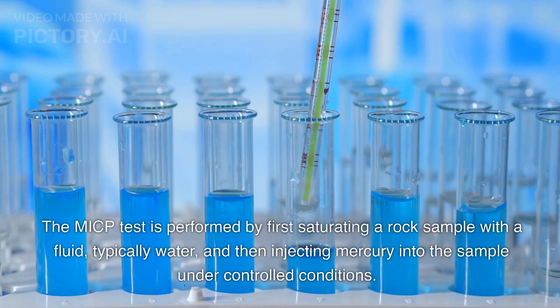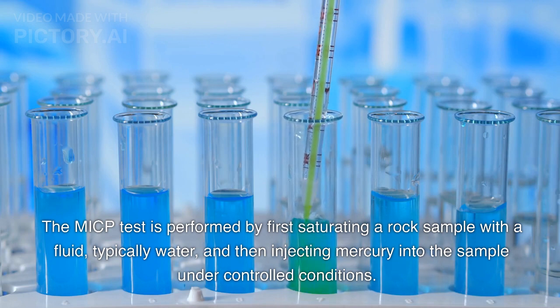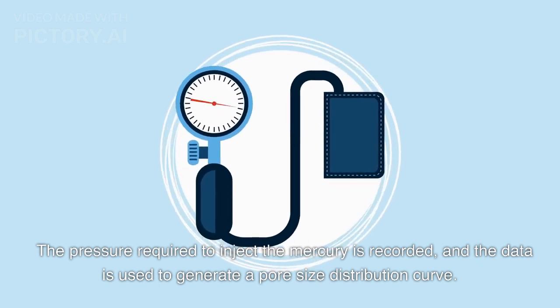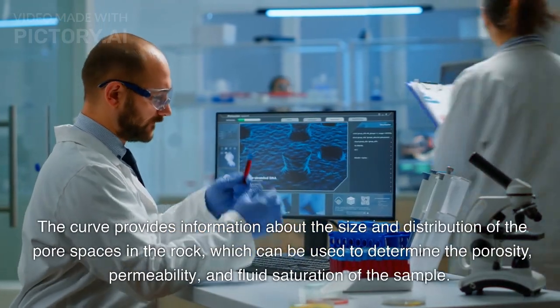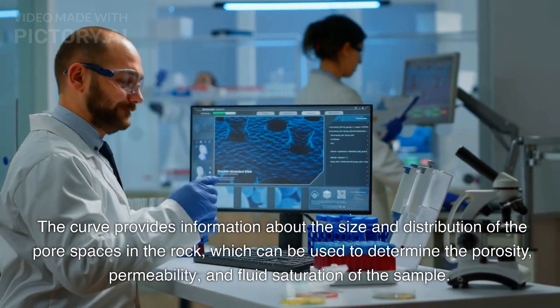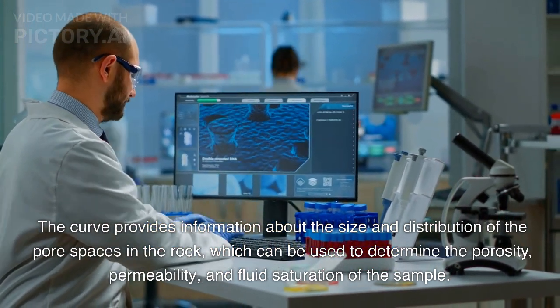The MICP test is performed by first saturating a rock sample with a fluid, typically water, and then injecting mercury into the sample under controlled conditions. The pressure required to inject the mercury is recorded, and the data is used to generate a pore size distribution curve. The curve provides information about the size and distribution of the pore spaces in the rock, which can be used to determine the porosity, permeability, and fluid saturation of the sample.